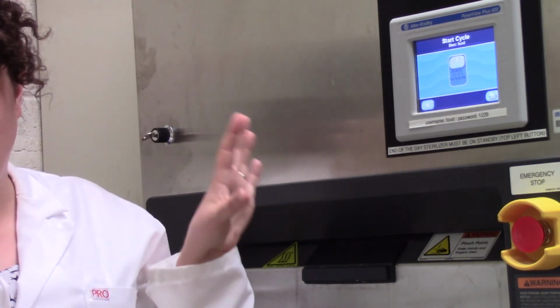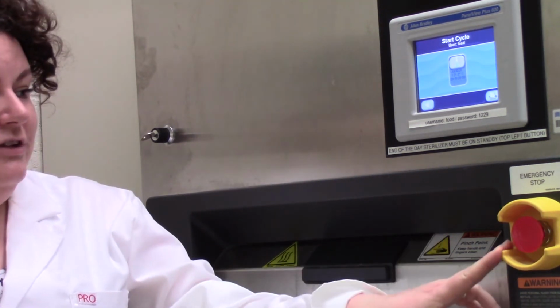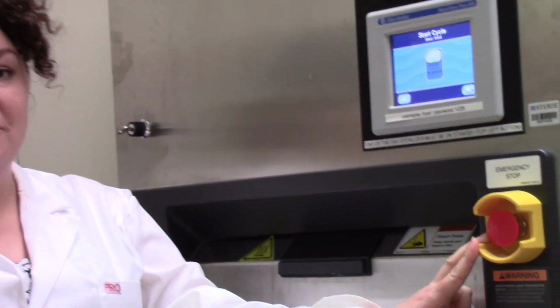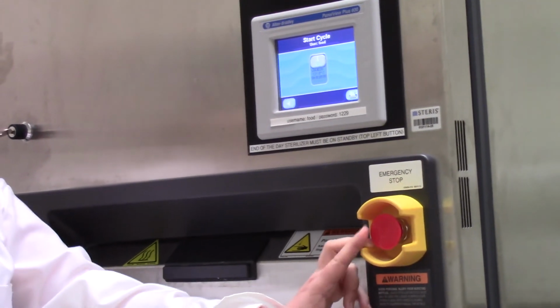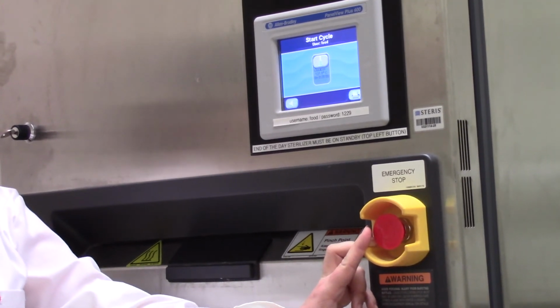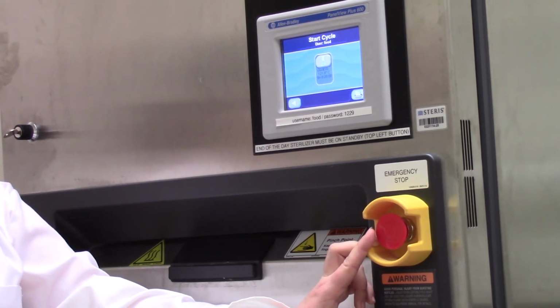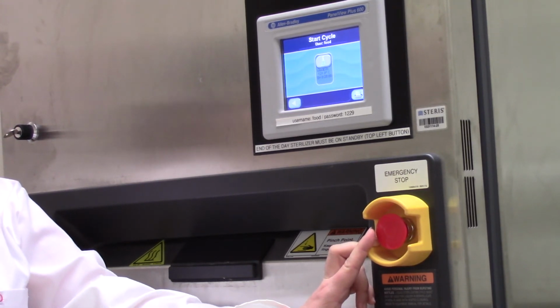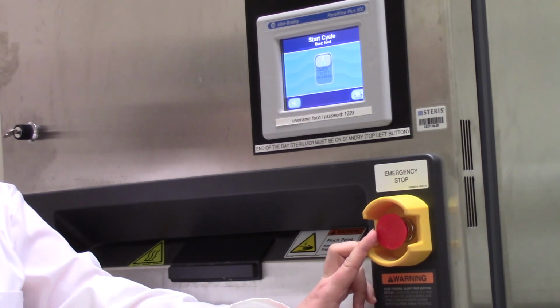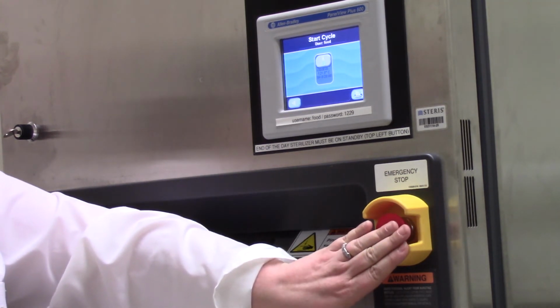So I'm just going to tell you another couple things before we get the cycle started. You can see to the side here that we have an emergency stop button. Now this is a great thing to have on because every so often, people make mistakes, and maybe you've started an autoclave cycle and realize that you actually accidentally put something hazardous inside of your load. This would be a situation where you would hit the emergency stop button.